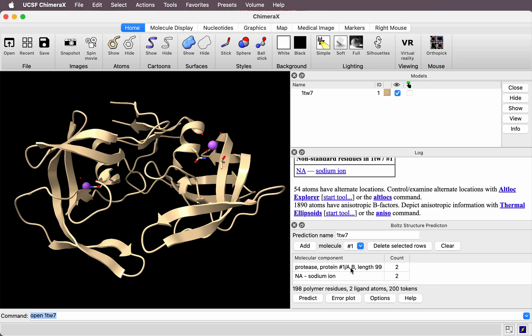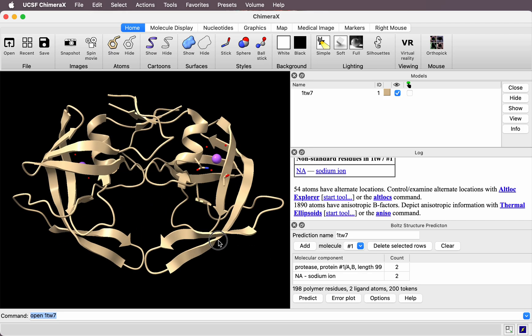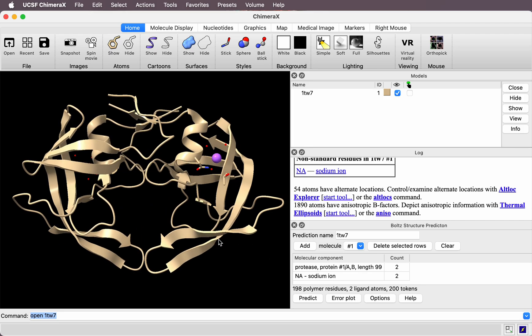It's added two copies of the protease monomer and two sodium atoms.